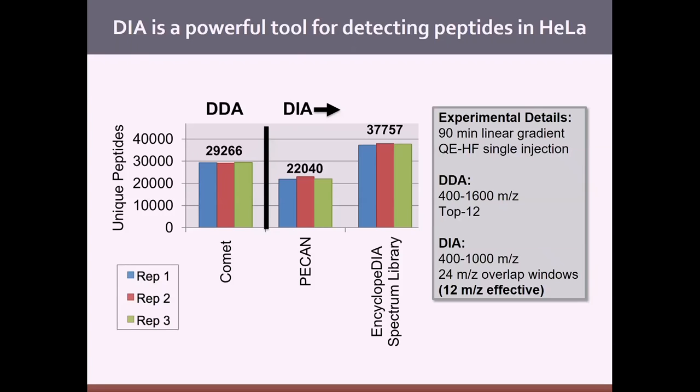So if you have a spectrum library and you have more information like retention time and also things like relative intensity of the fragment ions, the scores are set a little bit better separated from one another. So Pecan is basically, once you start querying for a very large number of peptides, in this case it's basically 14 million or 15 million tryptic peptides in the human proteome, that becomes a fairly large query space. And now we actually gain this sensitivity improvement, maybe sort of like what Alexei had brought up yesterday, maybe because the library has substantially reduced query space, because it's only the things that people have found previously in that sample, that it actually may be gaining that extra sensitivity because it's reducing the query space.